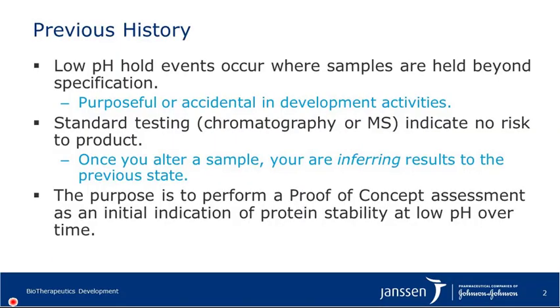So we were looking at conditions where previously in the history of working in this area, we've had some non-conformance events in manufacturing. This is many years ago. And the closing of those non-conformance events took months to complete, to plan, to do the work, and to close out.